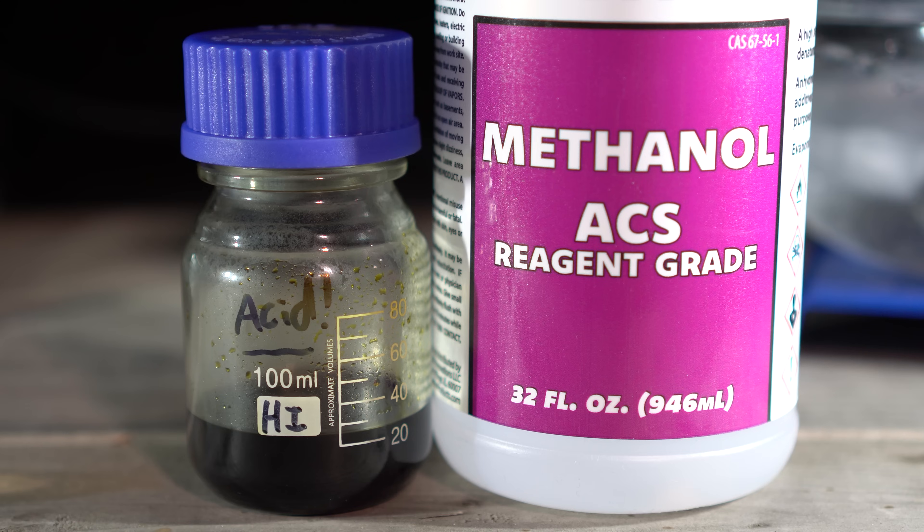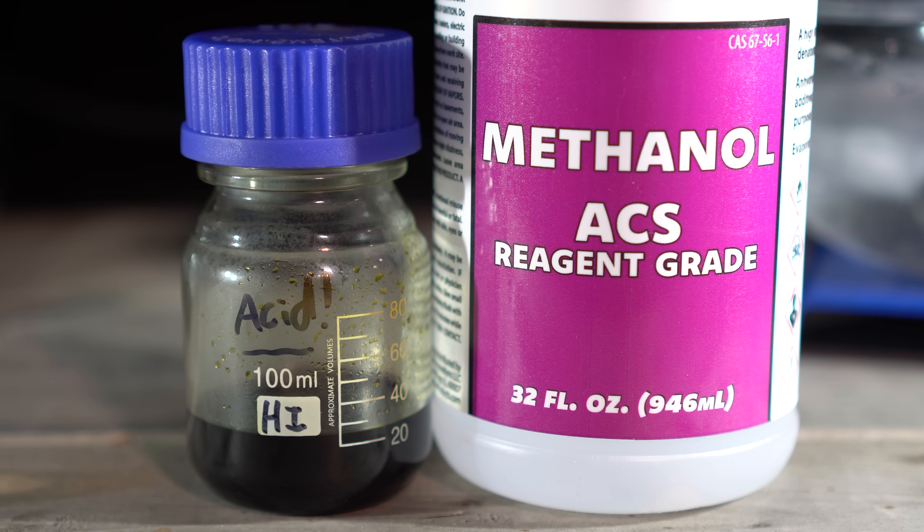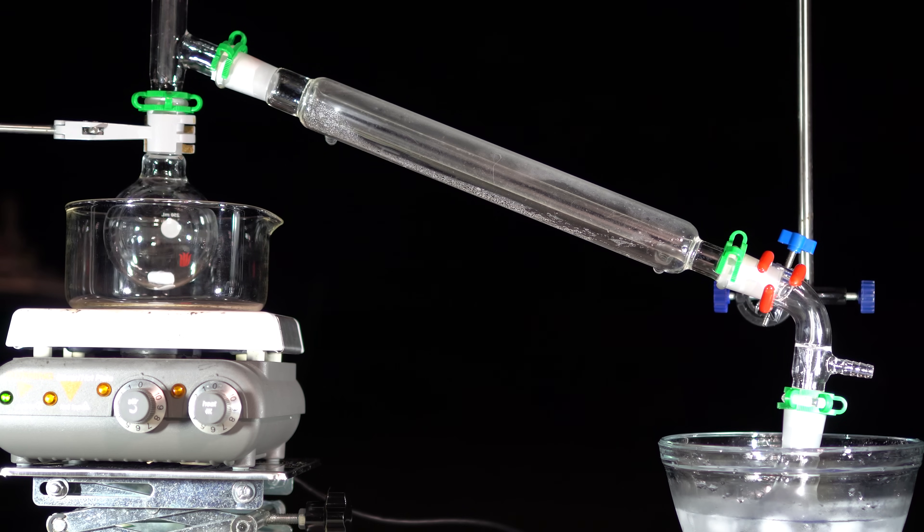Today, we will be making iodomethane. Iodomethane is commonly used as a methylating agent since it's an excellent substrate for SN2 substitution reactions. It is sterically open for attack by nucleophiles and iodide is a good leaving group. We are going to set up for a simple distillation as we will distill out the iodomethane after being formed.